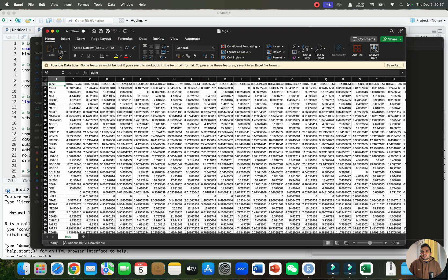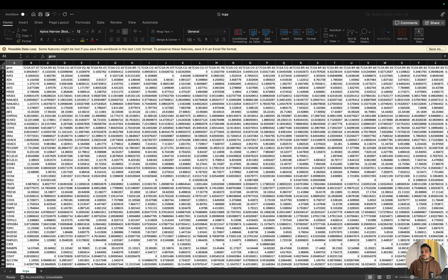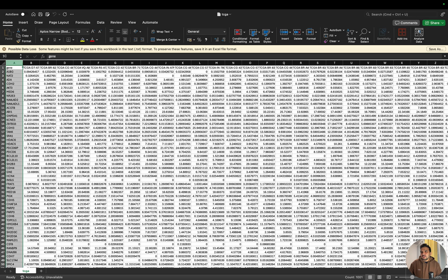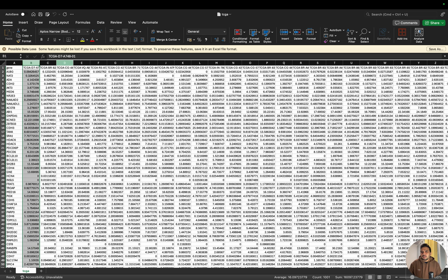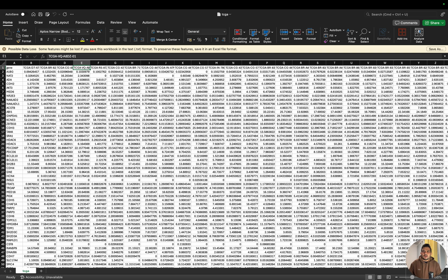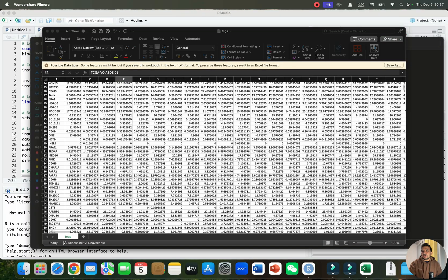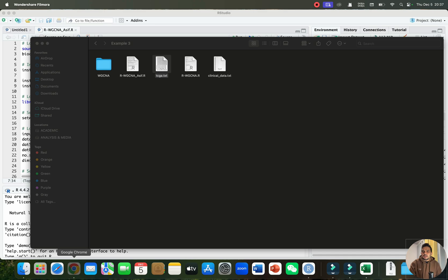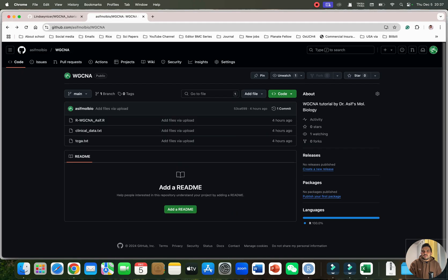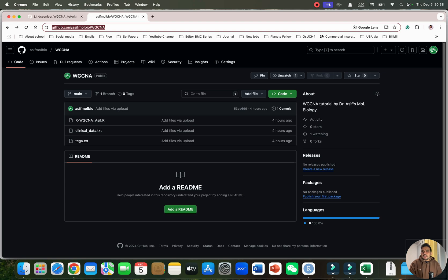You can organize your data in this format — the first column contains gene names, and the rows represent different samples or treatments. You can integrate your data for all genes into one file and export it as a .txt file, which makes it easy to follow the R script I have designed. I will be uploading this R script to my GitHub page, and I will paste the link in the video description.